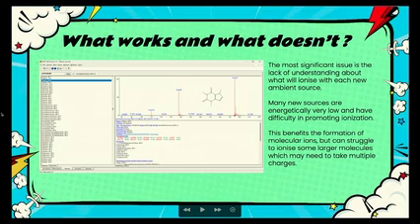Some of the sources can struggle to promote ionization. So you'll tend to find that sources struggle to ionize larger molecules, particularly molecules that might need more than one charge to get something to fly. Unusual, but not unheard of, to see ambient sources causing fragmentation, and you can promote fragmentation by going in the standard direction, doing in-source fragmentation, ramping up your source voltages and things.